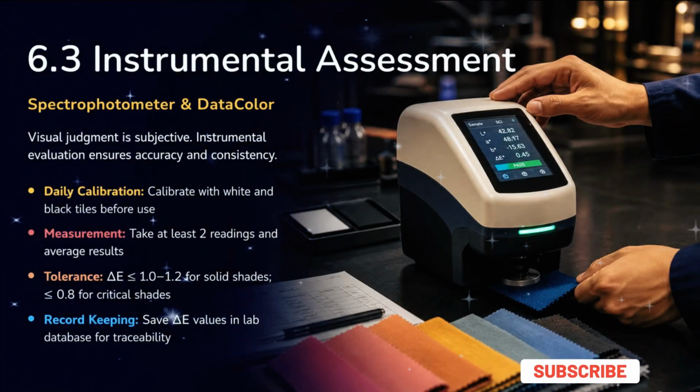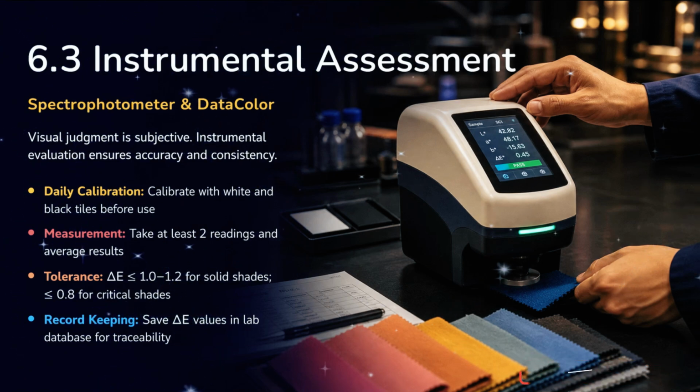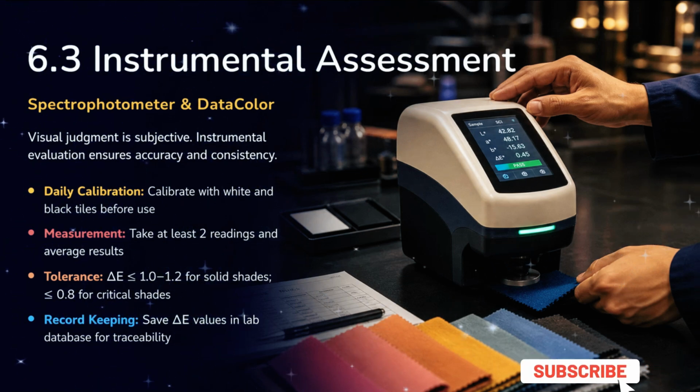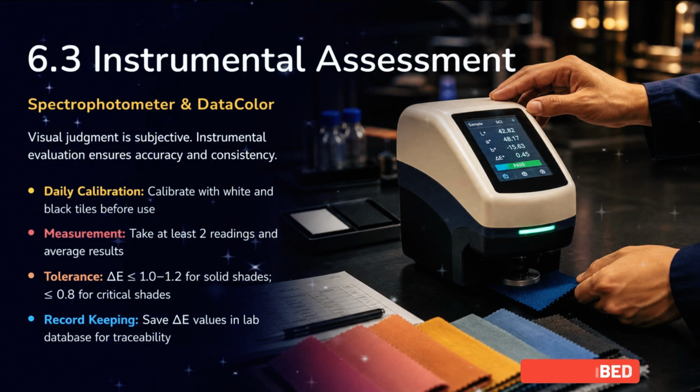Instrumental assessment with a spectrophotometer ensures accuracy and consistency. Remember daily calibration, taking at least 2 readings, setting appropriate delta E tolerances, and saving the values for traceability.